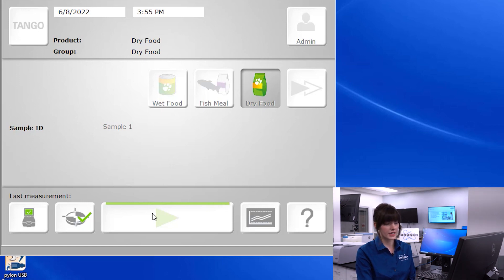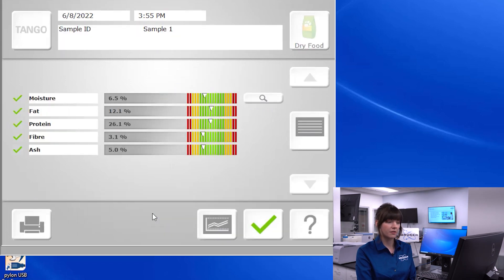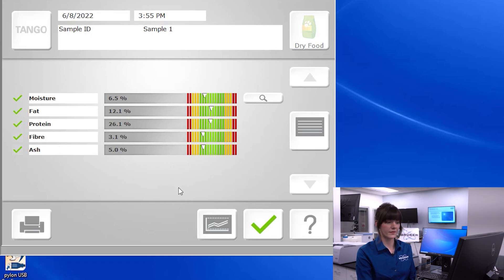After about 45 seconds, we're presented with our evaluation results, in which this screen provides you with both numerical values as well as visual indicators of where your results lie.